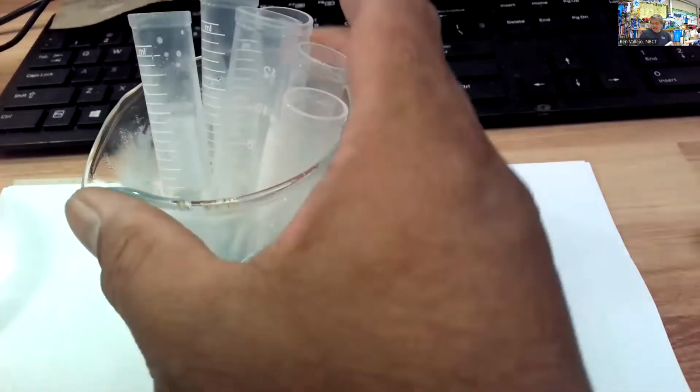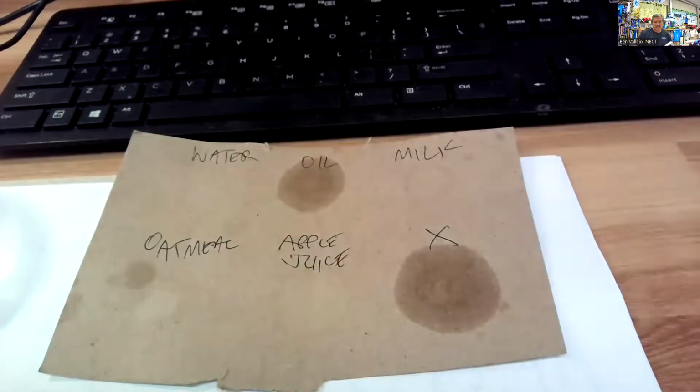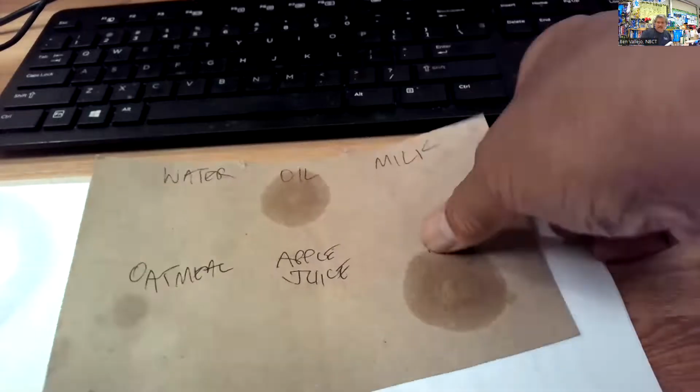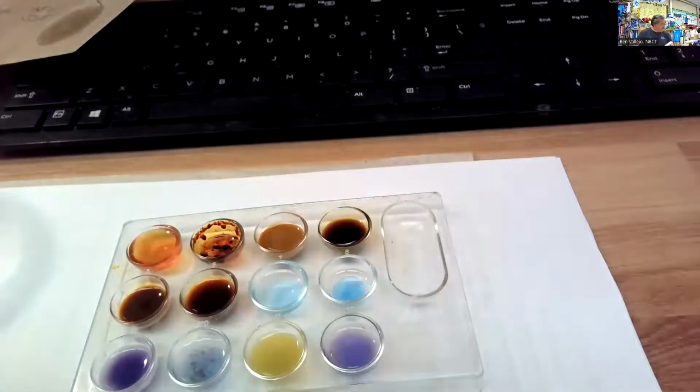Let's take a look at the data again real quick, and you can pause the recording if you need to. Here is the first test with the lipids. You can see that there is a translucent grease spot at oil and at X. Here are the spot plate results.